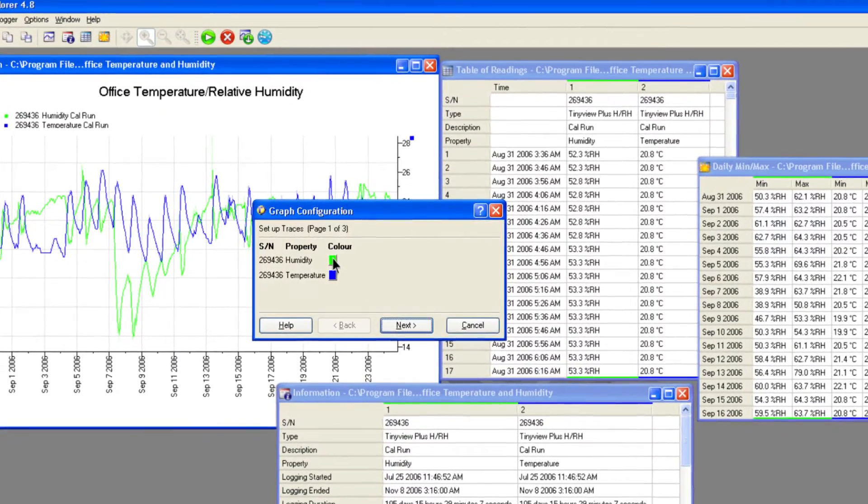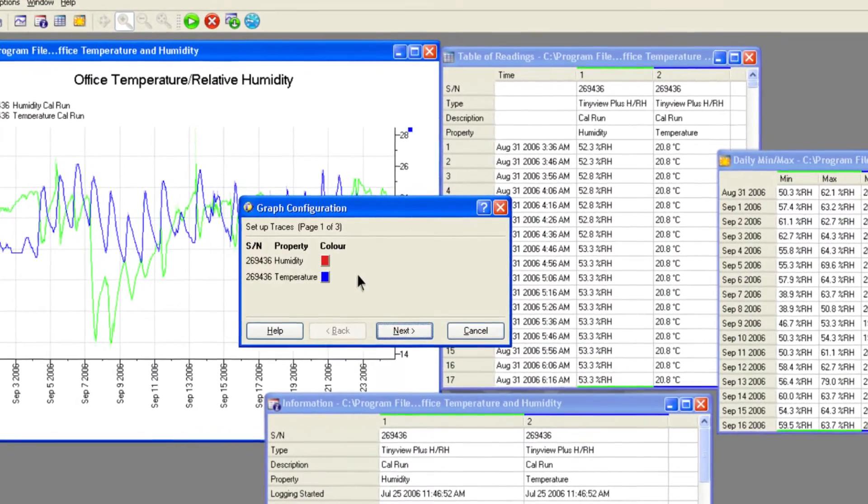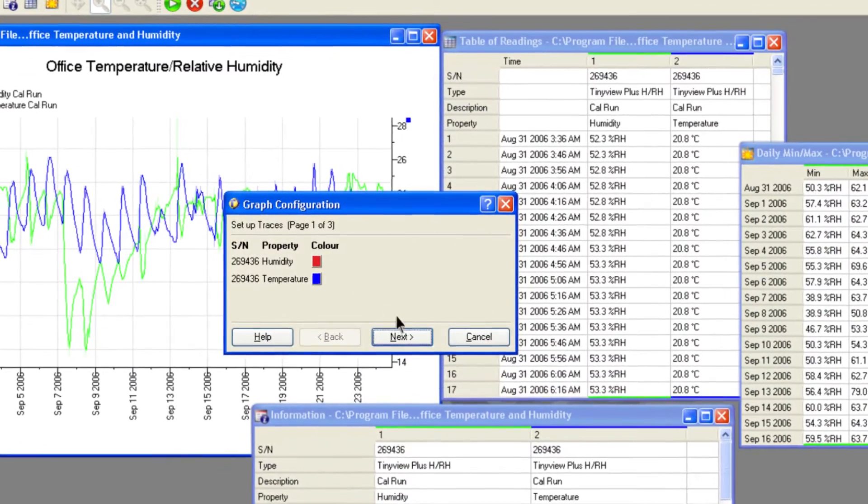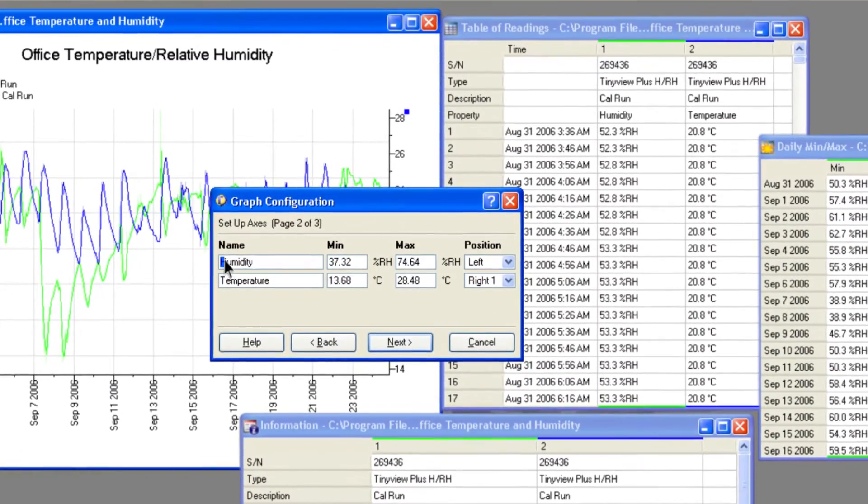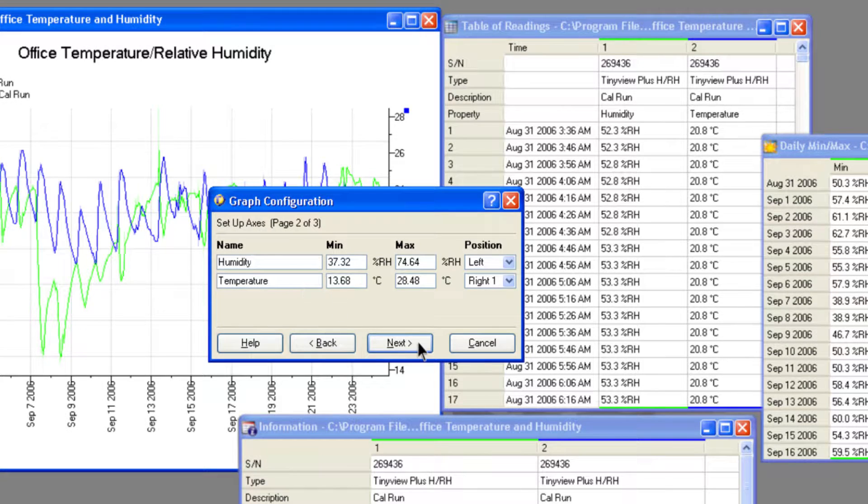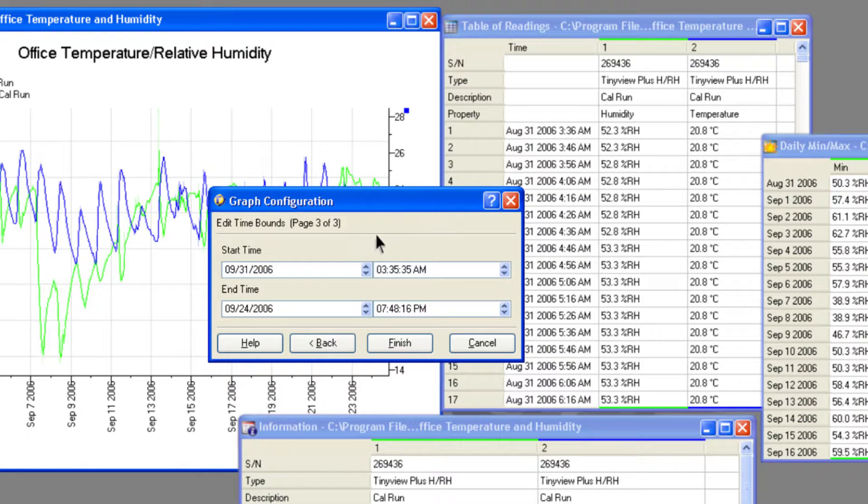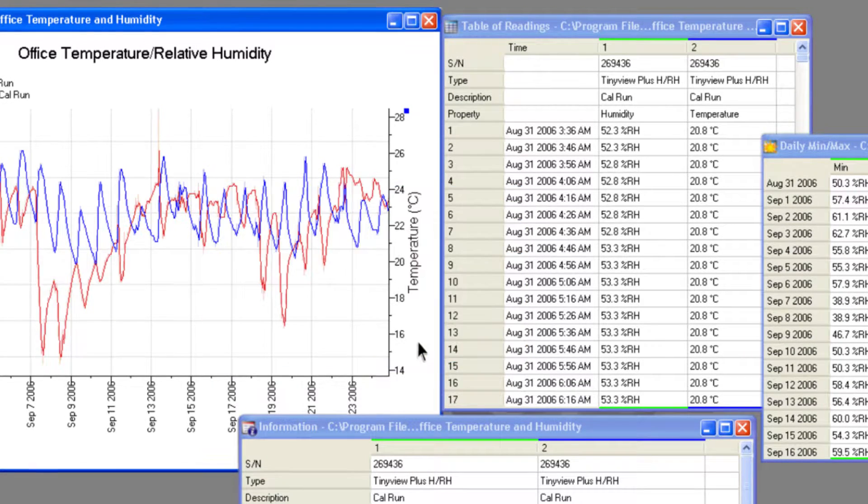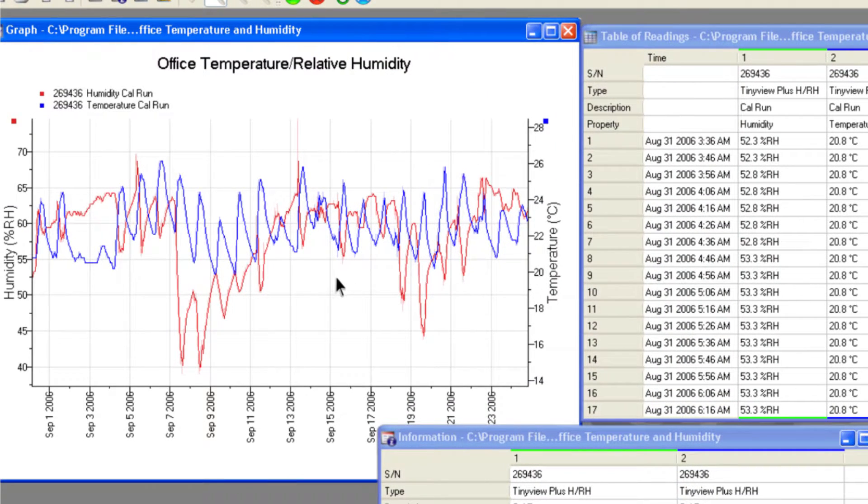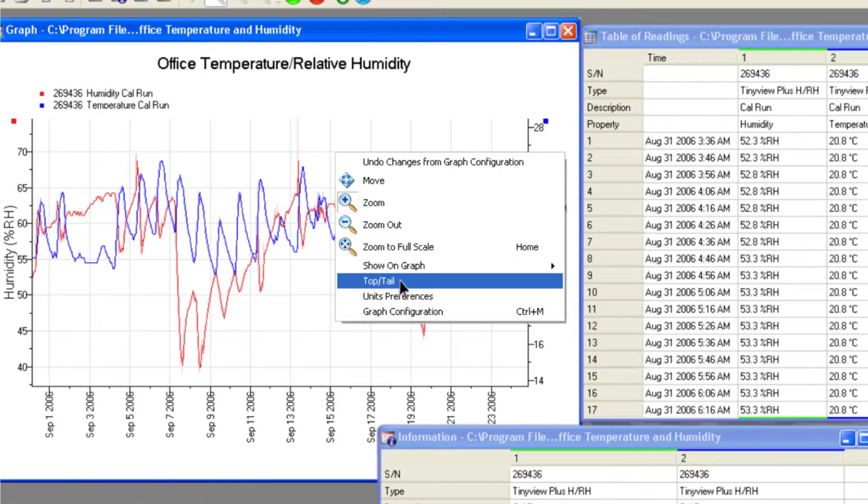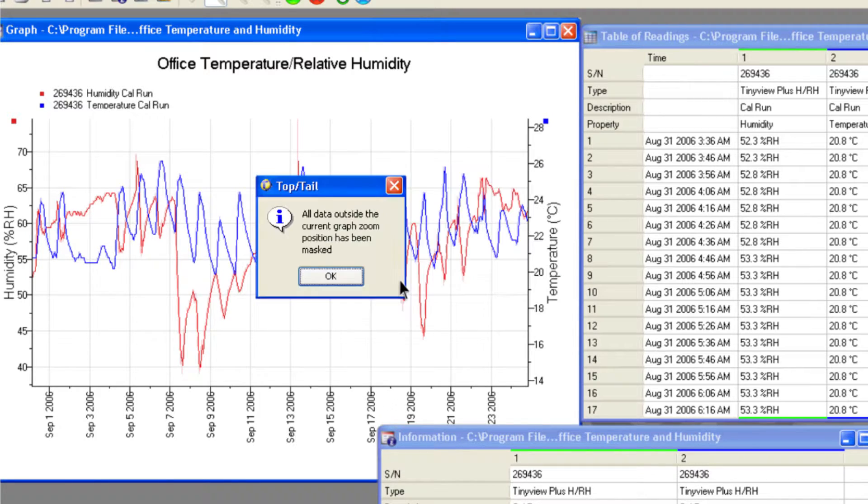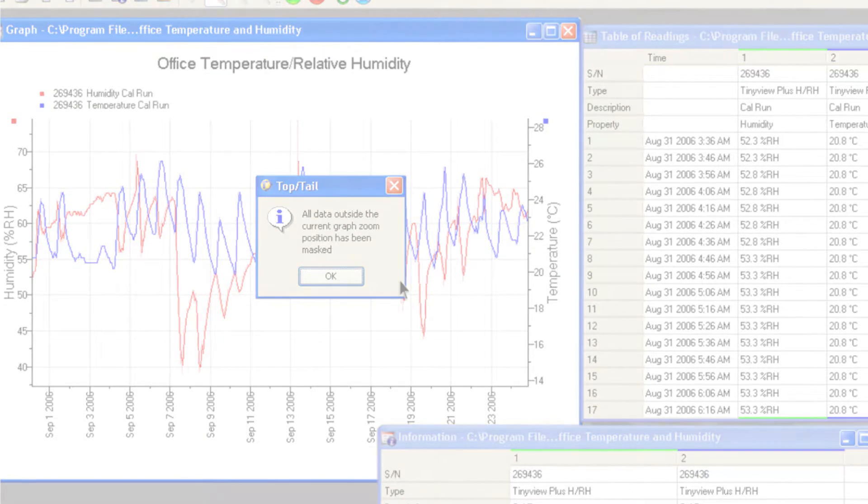Aspects of the graph view may be changed, such as the colour of the traces or the name or scale of the axes. If you are only interested in viewing a certain section of the data, you can mask the rest using the top and tail tool.